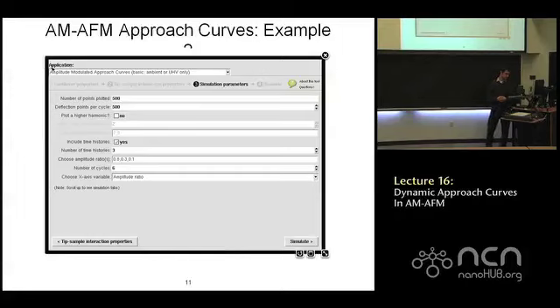Also, I skipped over this before, but let's go to the time histories and select 0.8, 0.3, and 0.1 for the amplitude ratios where we record time histories.